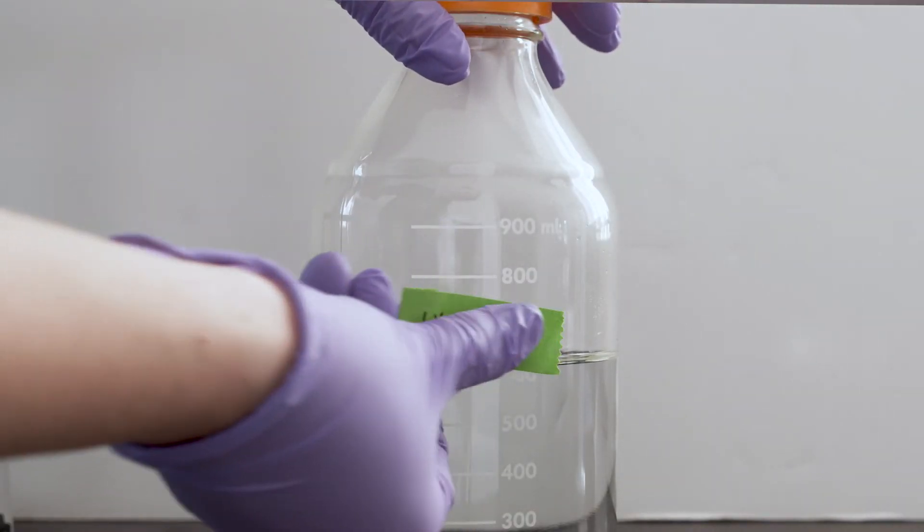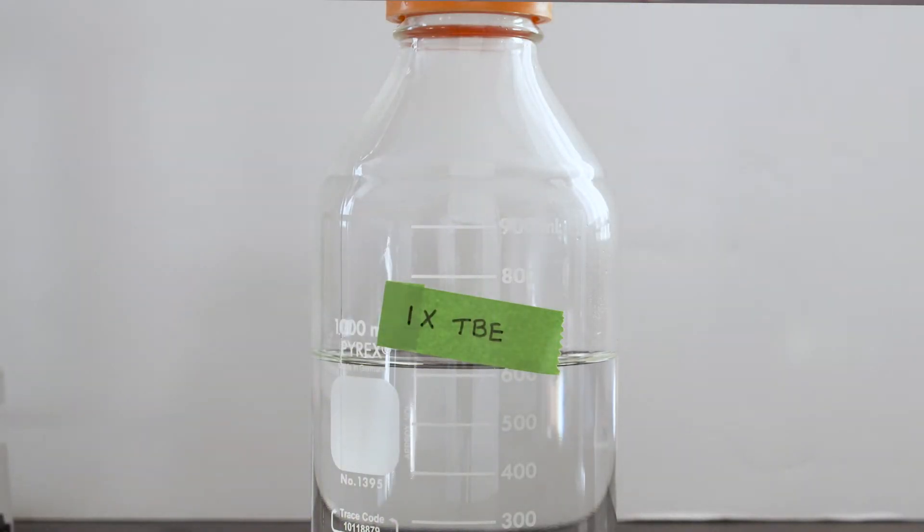1x TBE buffer can be stored at room temperature for three months when stored in a closed container. Now that the casting platform is set up and we have a sufficient supply of 1x TBE, we can make our gel.